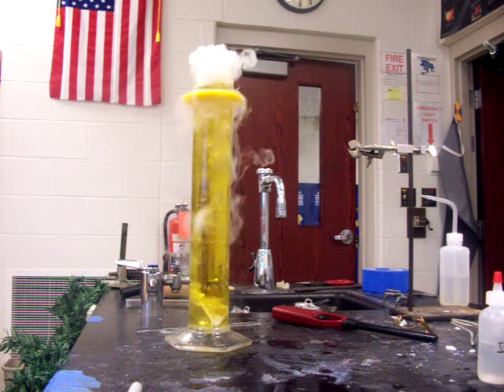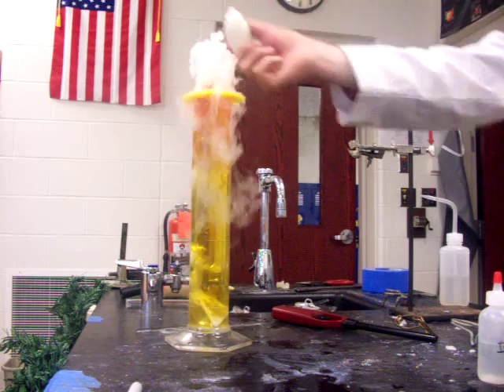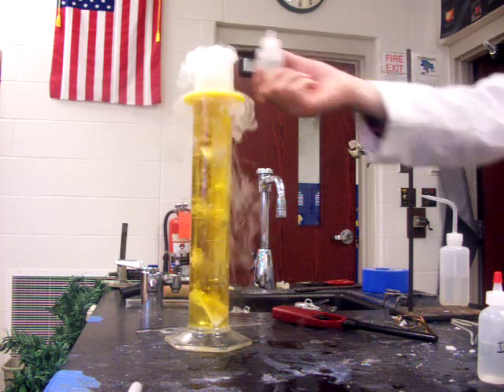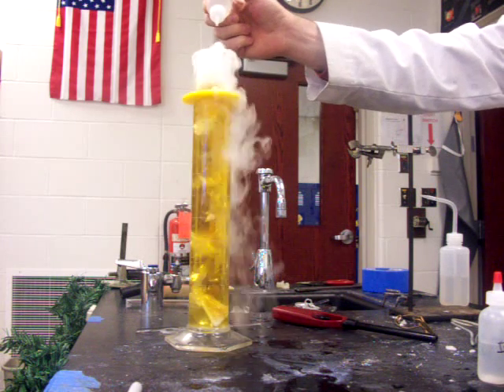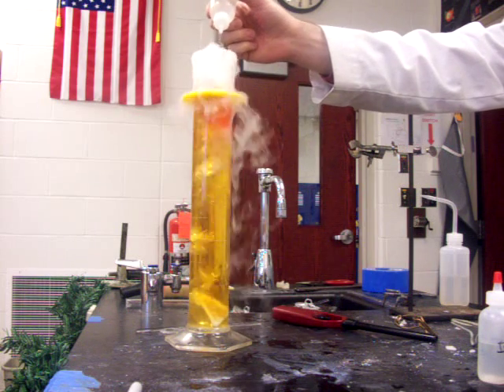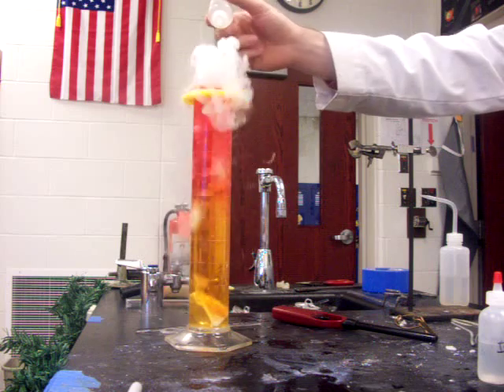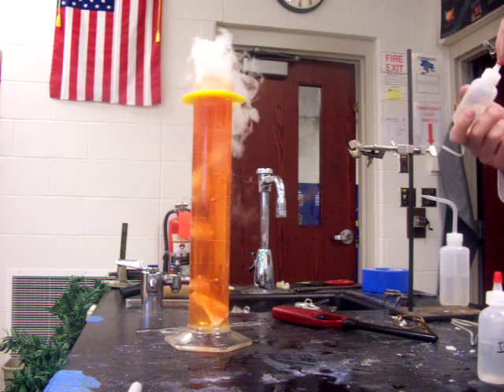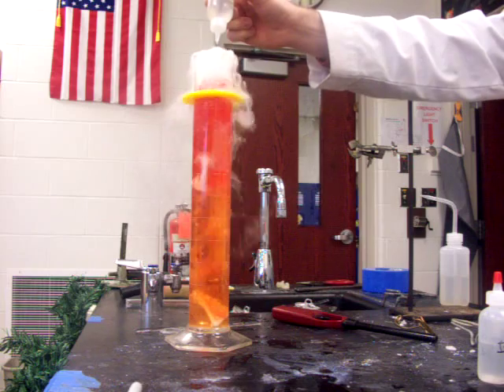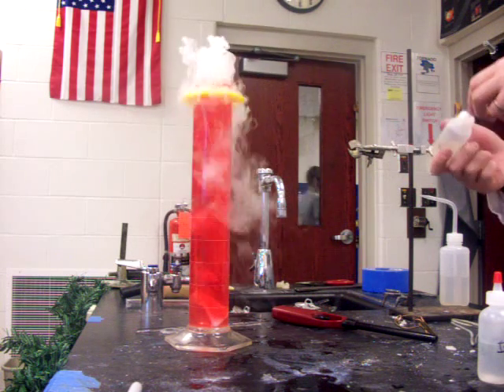So I'm going to add a little bit of real acid to this. That should turn it to a red color if I get enough. I'm adding an acid to push it all the way to its last color change. So there we go.